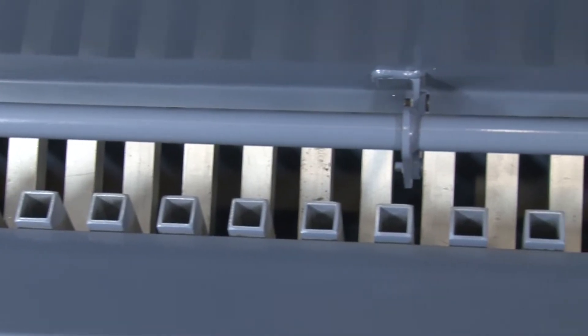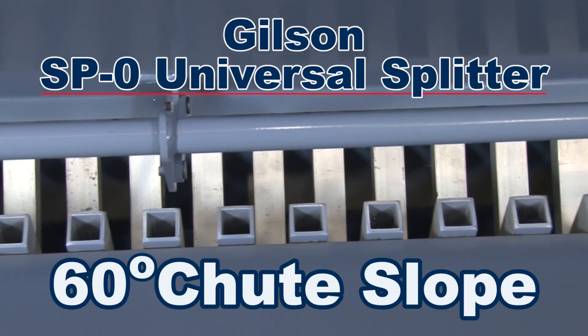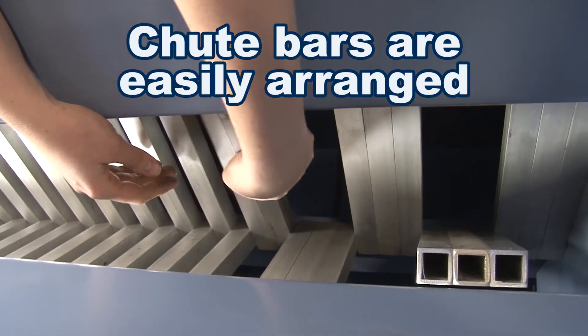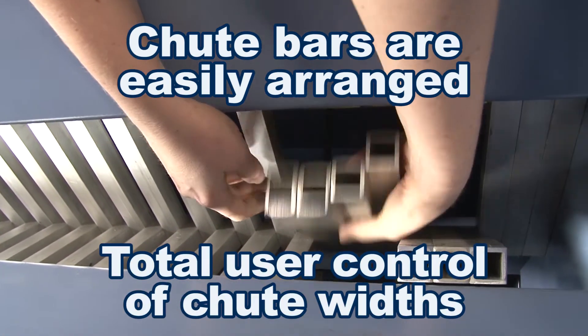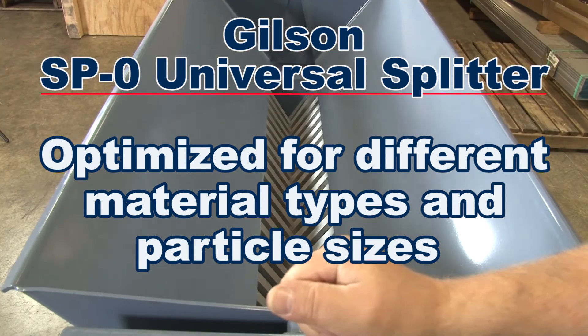The SP0 splitter chutes are formed by a series of one-inch bars mounted in a 60-degree v-shape. These bars are easily arranged to allow total user control of chute widths, optimizing the SP0 for different material types and particle sizes.